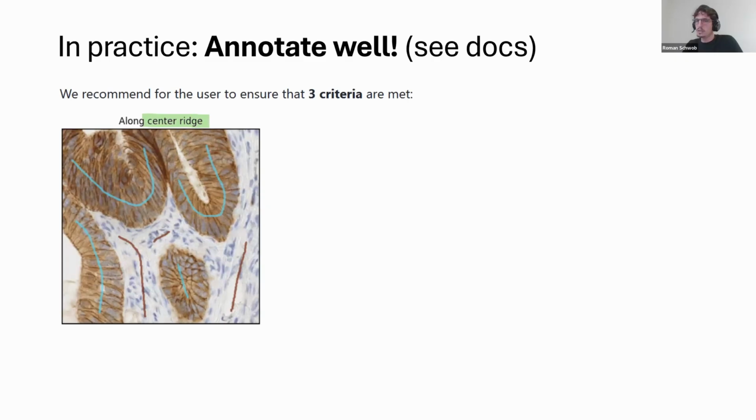Wait, I'll just check the question. Yes, I'll actually get to that in the next slide, Daniel. Thanks for the question. So first, let's focus on the annotations.